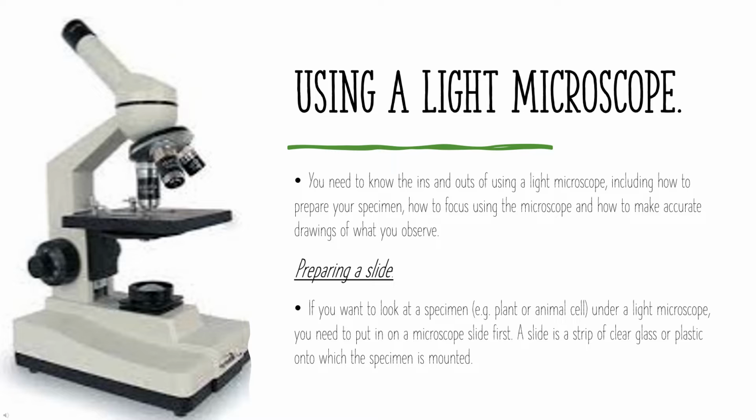And this is very important for the science GCSE, the biology GCSE, because it will often come up. I can guarantee you guys that one question will come up in your GCSE about the light microscope. It can be either how to use it, how to prepare a slide, or naming the parts of it. So you can have a look at it, and you can also copy a sketch in your notebook. Notebooks are very important for revision in the future.